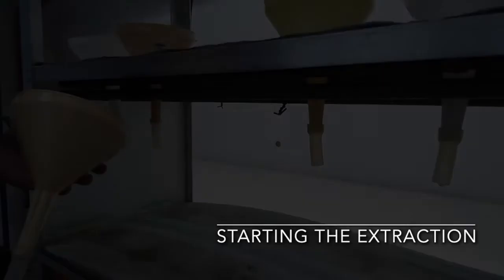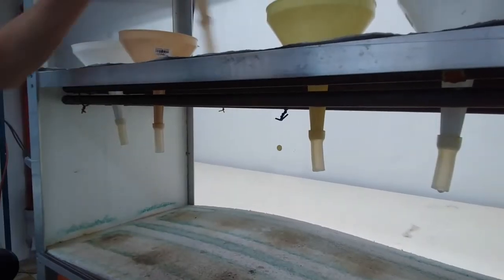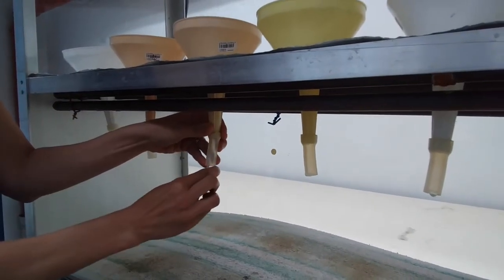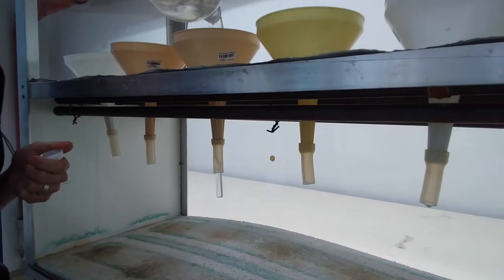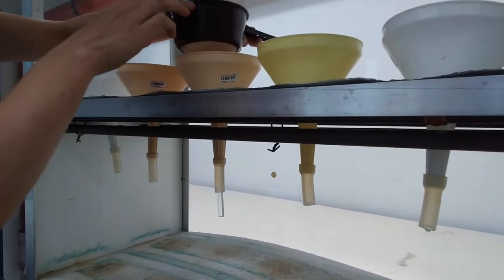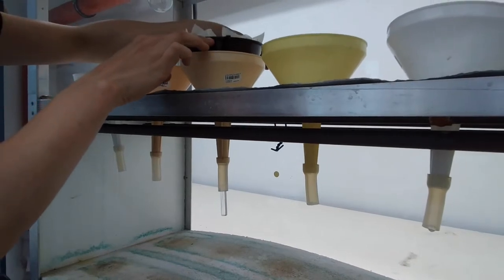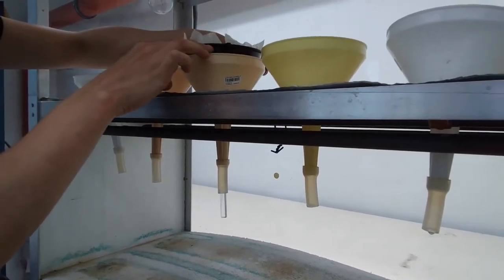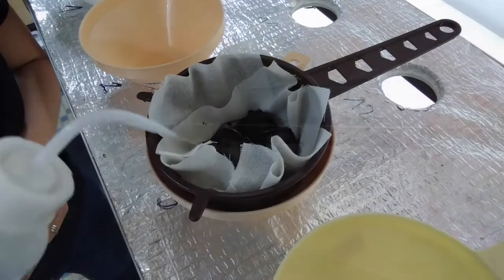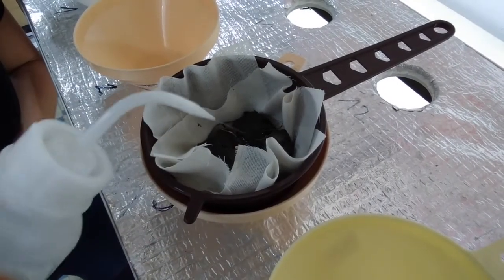To prepare the extractor, place the funnels in the funnel holders, attach the vials at the bottom of the hoses, and fill the funnels with drinking water by about a half. Then gently place the sieves with soil and litter on top of the funnels. The substrate should be fully soaked but not submerged completely. Add more water if needed.